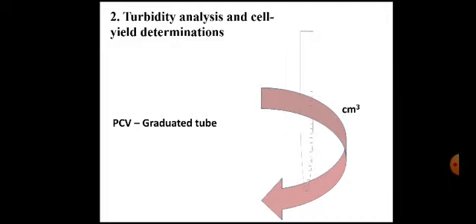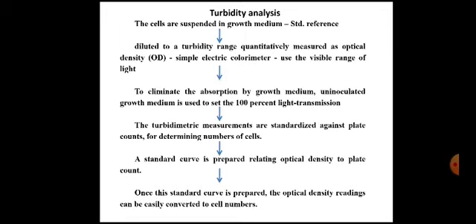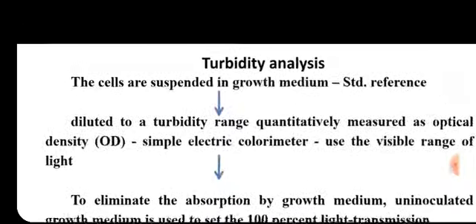That is the method of packed cell volume. Another method of measuring biomass is turbidity analysis. This is the protocol for turbidity analysis. We'll see it one by one.